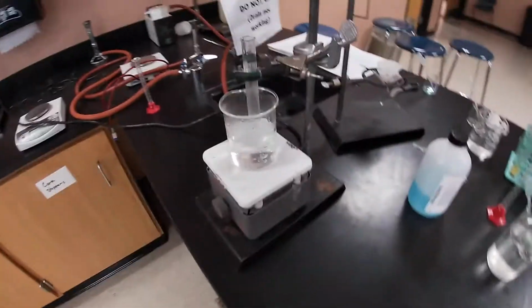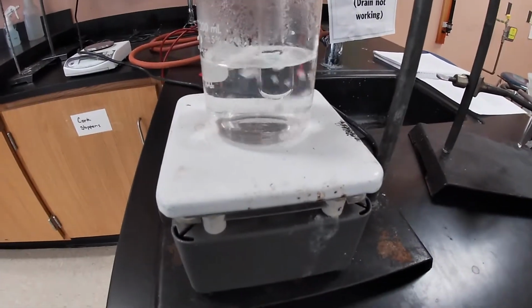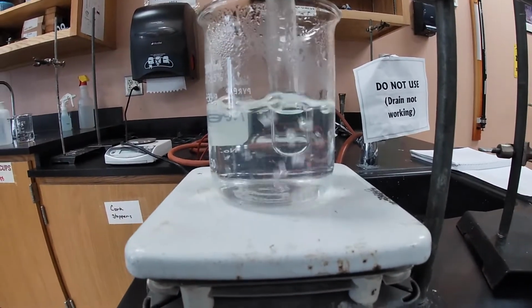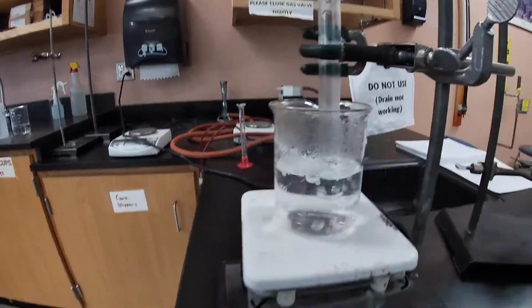All right, so then we're just gonna place our Benedict solution with the filtrate into our boiling bath, wait about 5 minutes, and then see what happens.